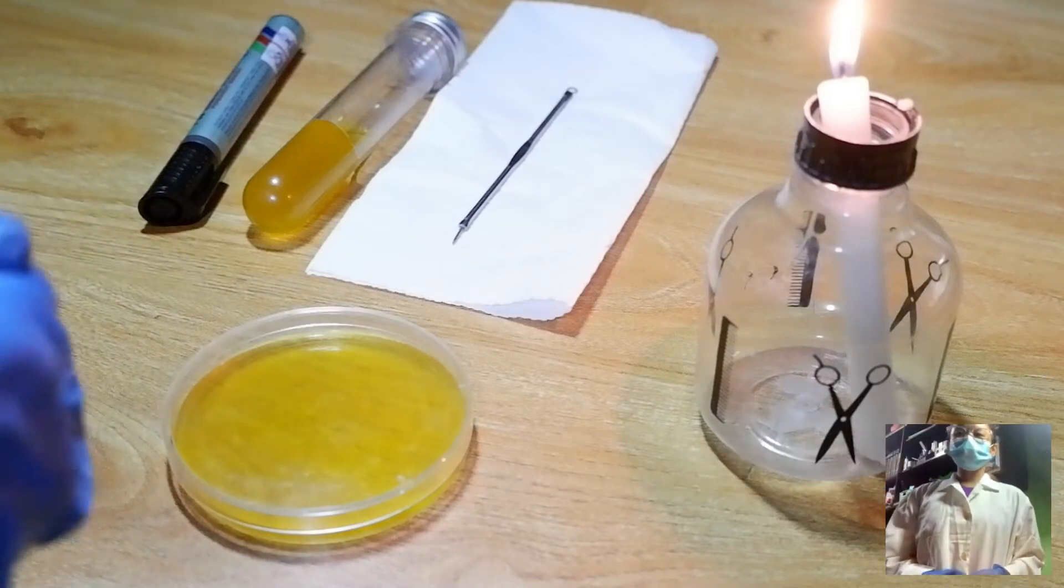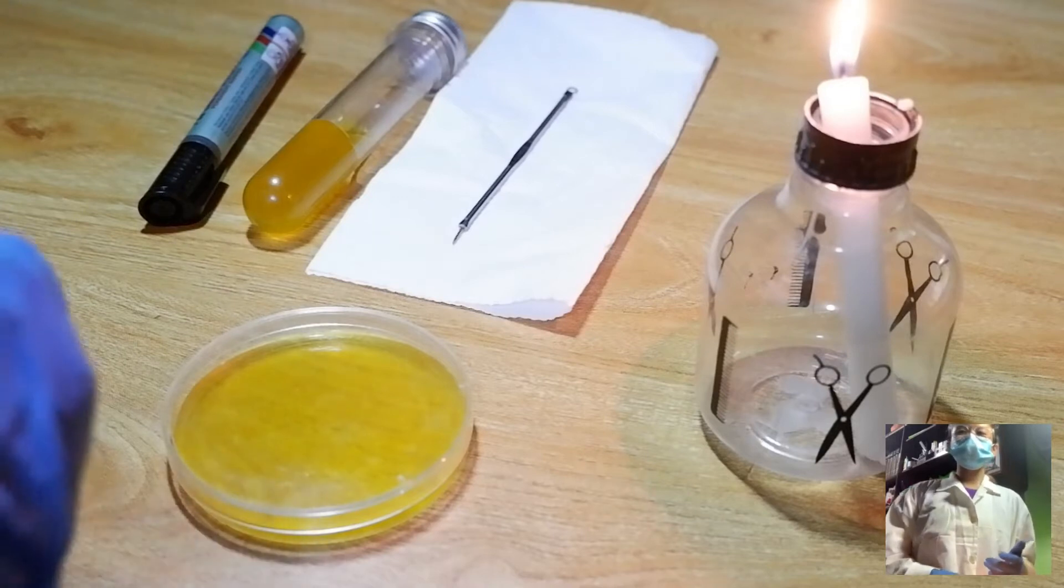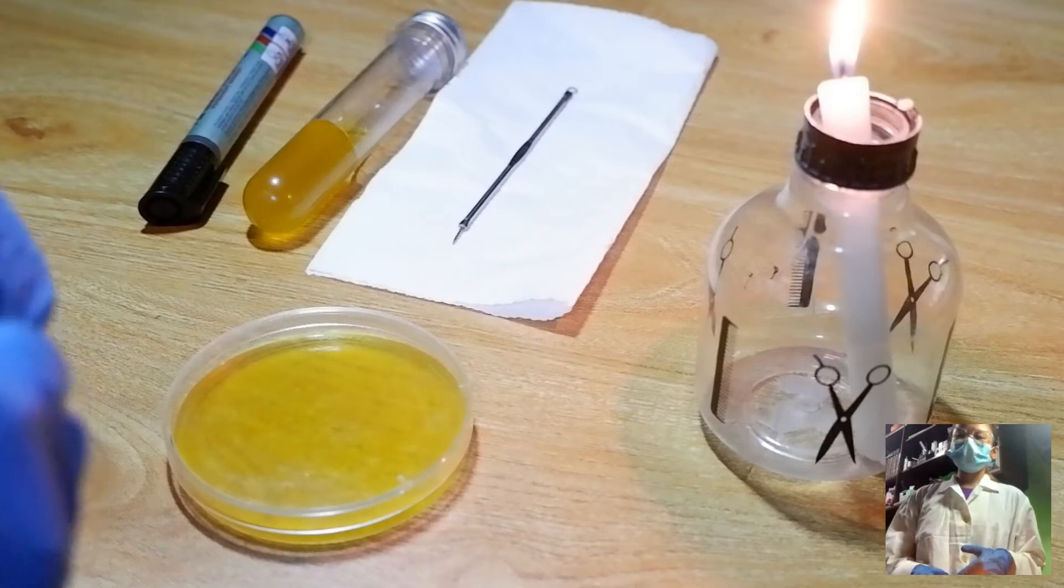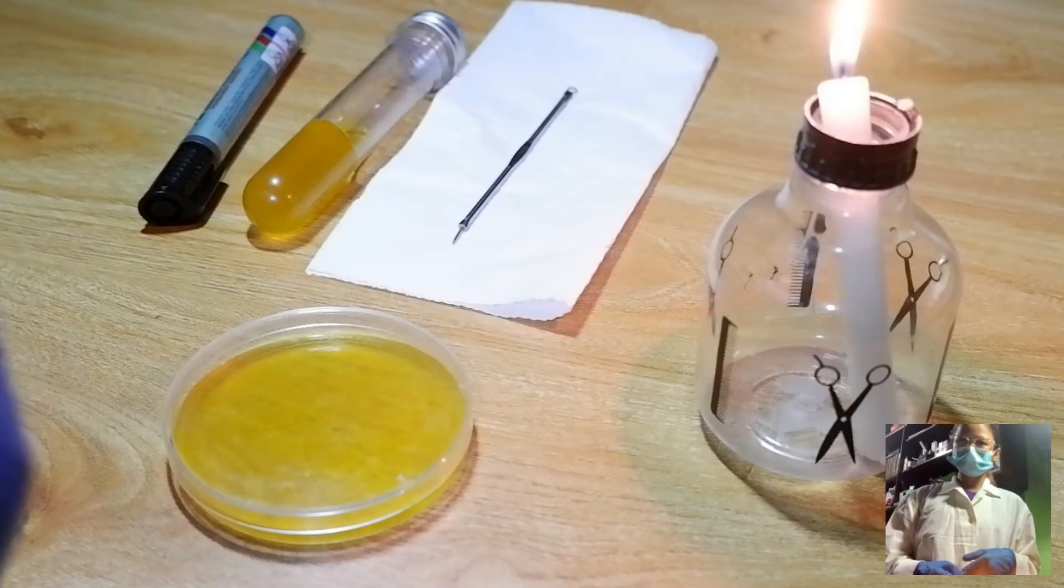At this point, I will demonstrate the quadrant-streaking technique. Our main purpose here is to isolate the mixed population into pure culture of most organism. This method allows sequential dilution of the original microbial material.